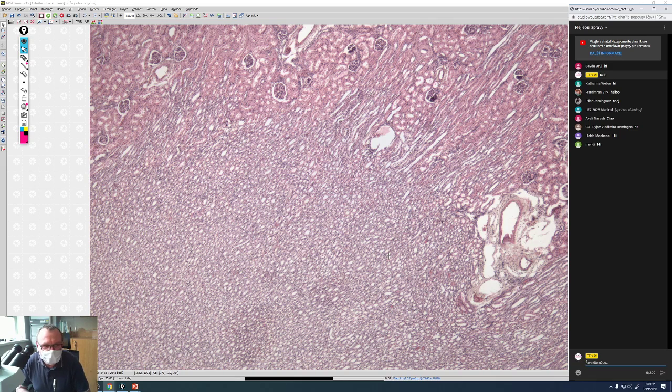Okay, so welcome to the first live stream of a histological practical training. We are in the histological department with our lecturer Andrea, who will participate in this practical training.